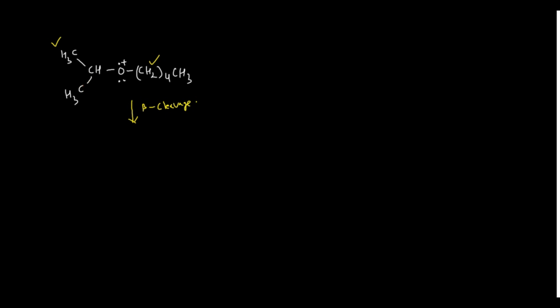So I am breaking it. Say this. So one of the electrons will go to this methyl group and one electron will jump here and one electron will come from this particular oxygen atom, and this will produce this particular species, right?